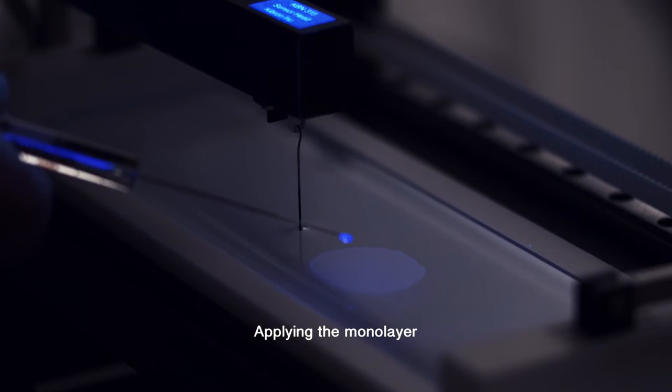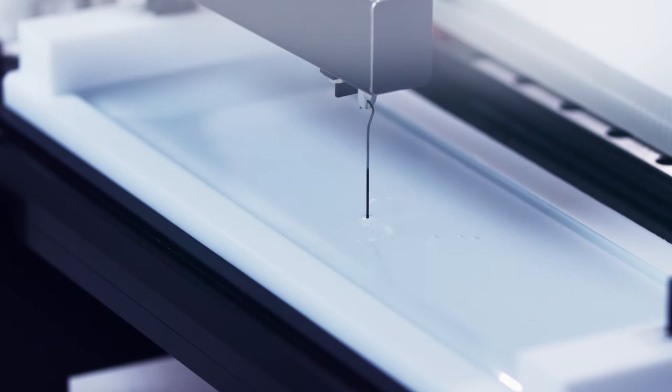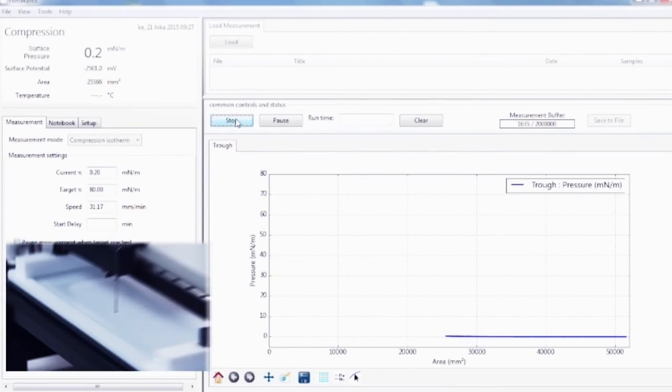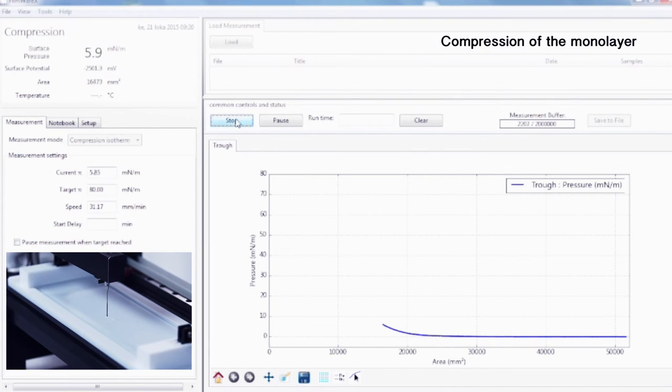In a typical experiment, the sub-phase is placed in the Langmuir trough and a known amount of substance is spread on top of the sub-phase using a volatile solvent in a drop-wise manner.